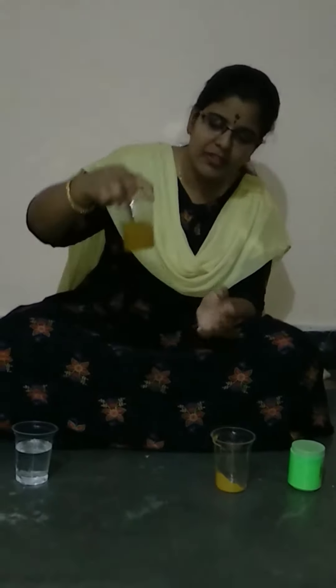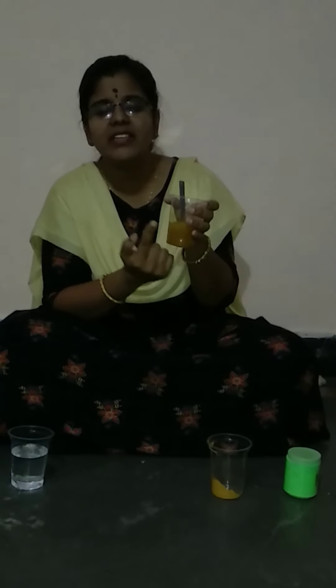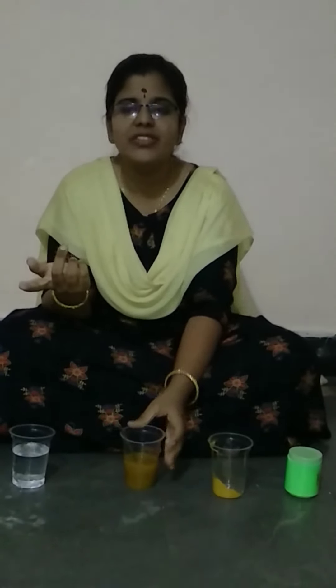We have taken calcium hydroxide, and that calcium hydroxide reacted with the acetic acid and formed salt and water, which is shown by the indicator. Initially it was a very dark red color, but on neutralizing, it has come back to its original color — that is yellow color. So this is what the titration reaction is.